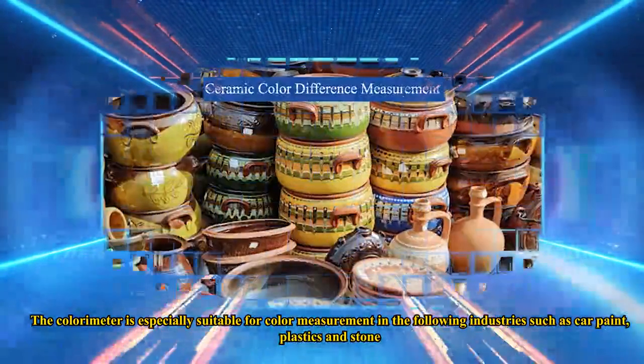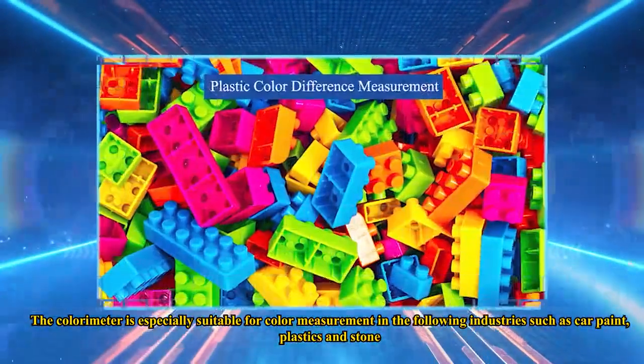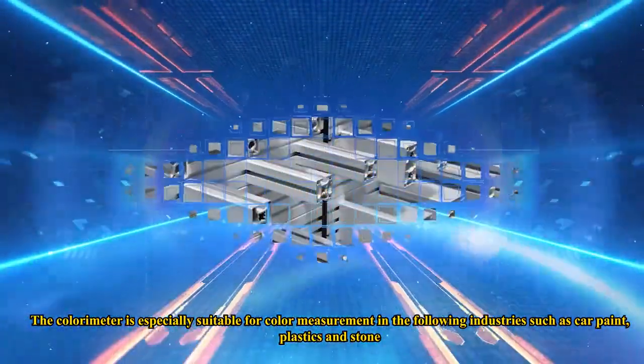The colorimeter is especially suitable for color measurement in the following industries: car paint, plastics, and stone.